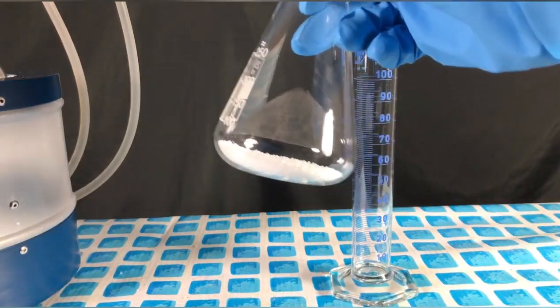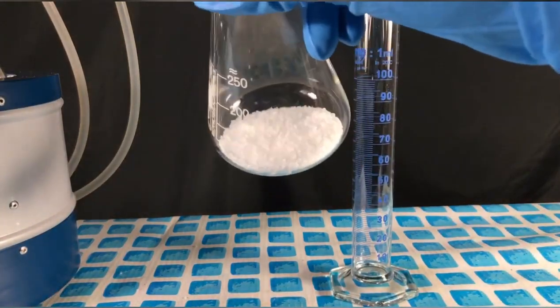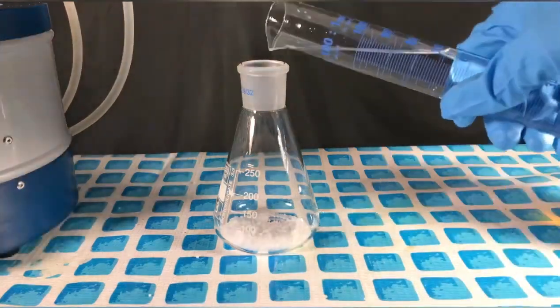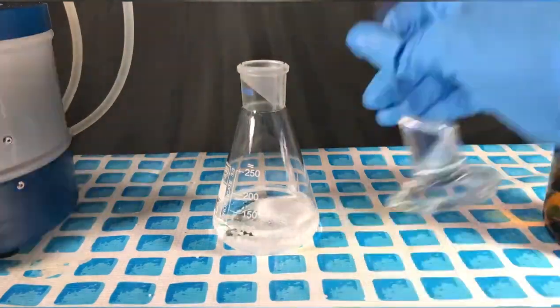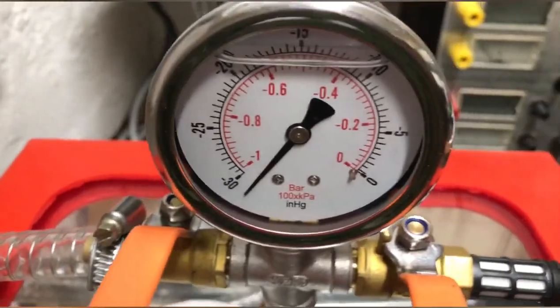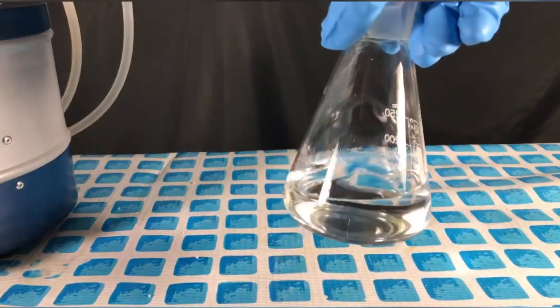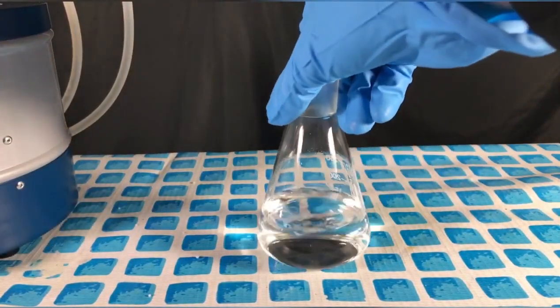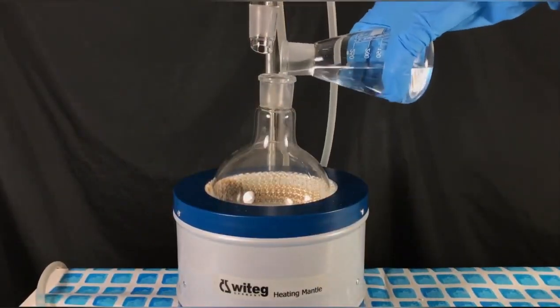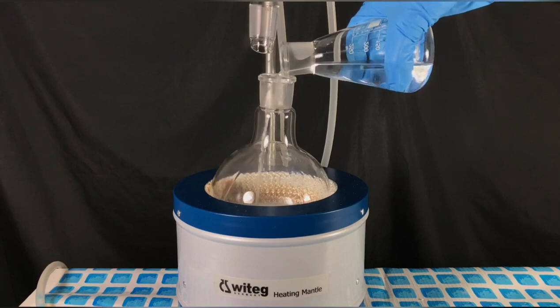15 grams of urea were weighed out and dissolved in 120 milliliters of ethanol. By the way, I dried the urea over anhydrous calcium chloride in a vacuum desiccator overnight. The urea-ethanol mixture was left on a hot plate until all of the urea had dissolved. The hot urea in ethanol solution was added to the 1 liter round bottom flask.